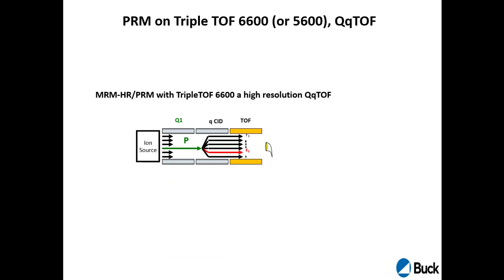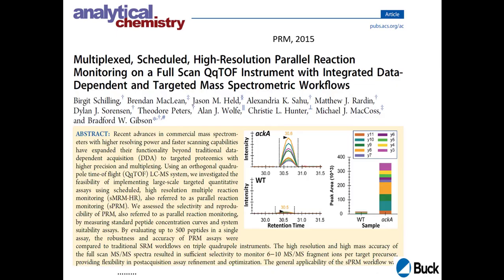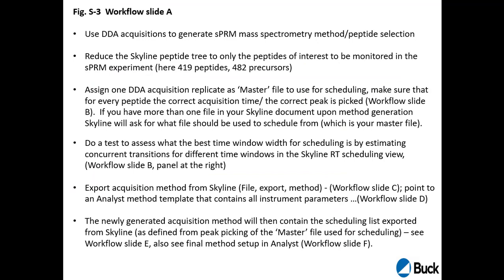And so we talked about the PRM, what we're doing. We have the precursor ions that we have to fragment. On the website that Ned and Brendan are doing, you can find this paper that we published. It has a really good supplement also, which walks you through the instrument setup step by step. I recommend that.